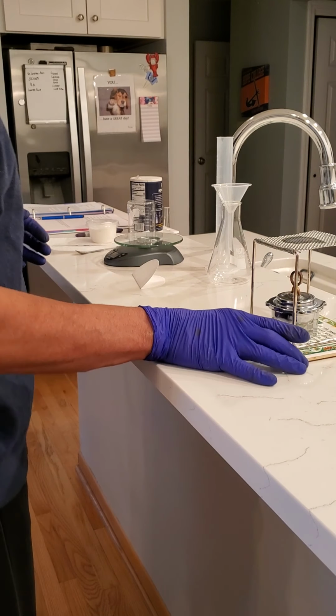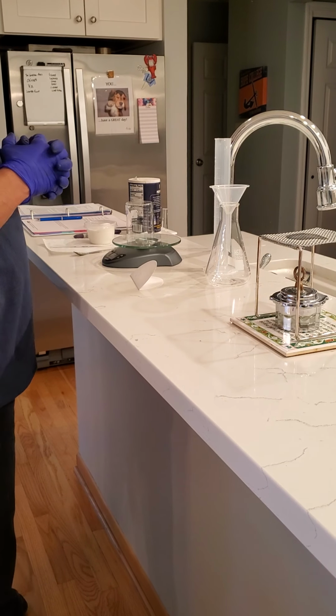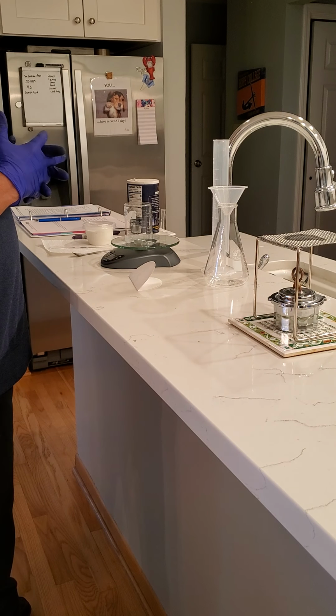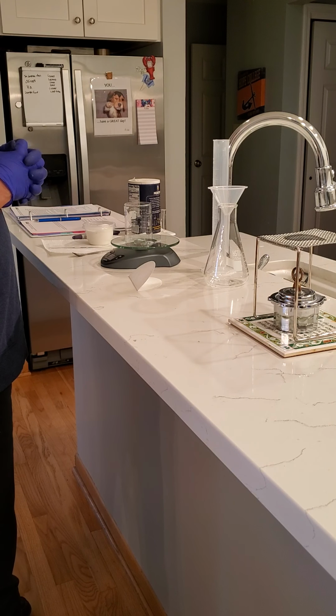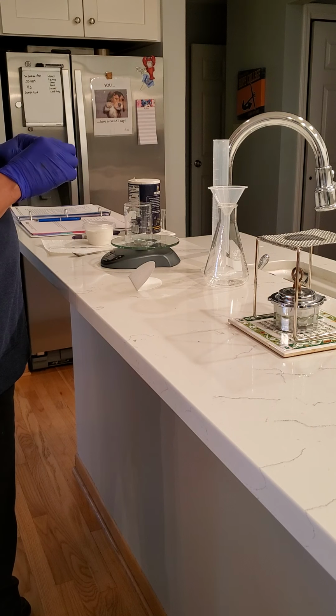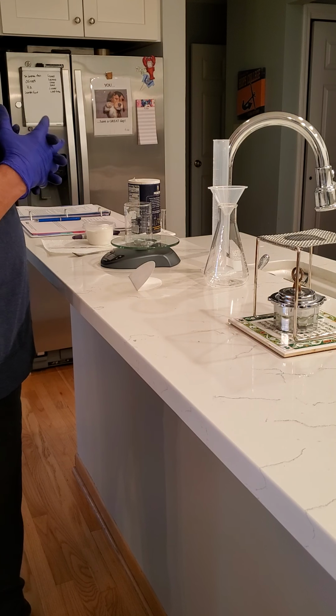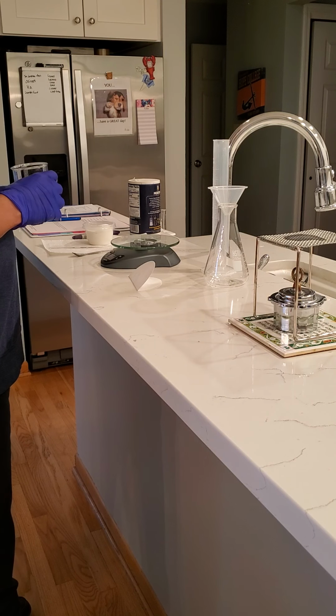Okay, class, so I'm going to demonstrate the quantitative measurement of solubility. And what we're going to do is prepare a saturated solution of sodium chloride or just table salt. By saturated, I mean we've added enough sodium chloride salt solid to a given amount of liquid so that it no longer dissolves and it actually will stay as a solid in solution.